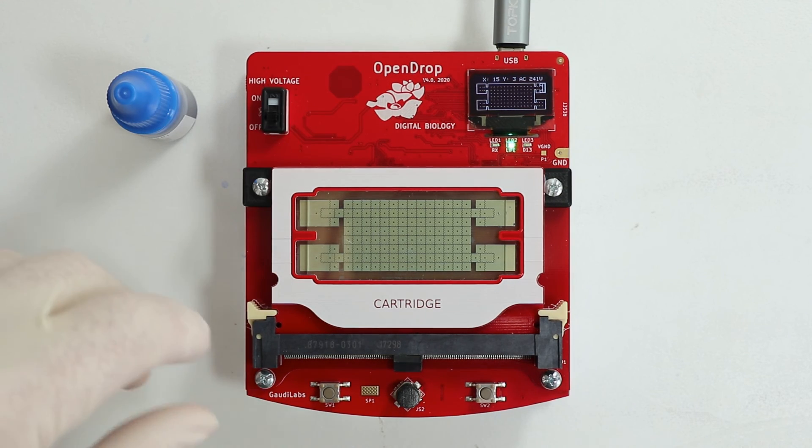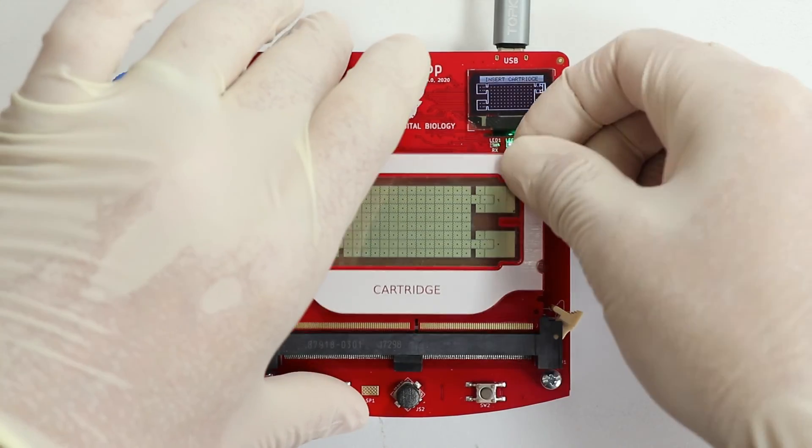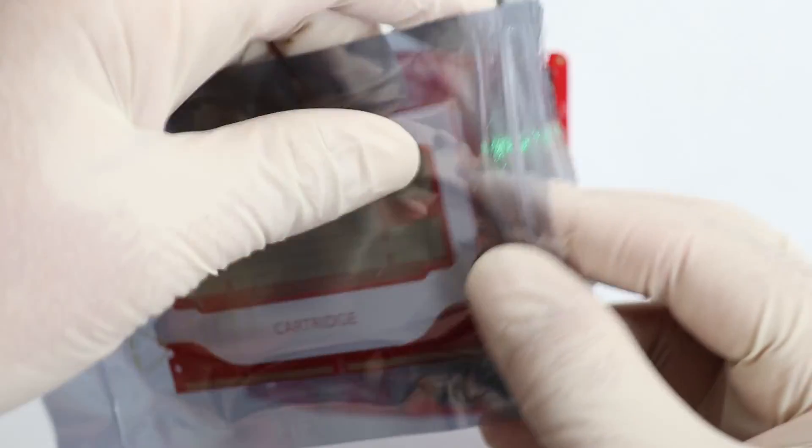Turn off the high voltage before removing the cartridge, and store the cartridge back in its original package after use.